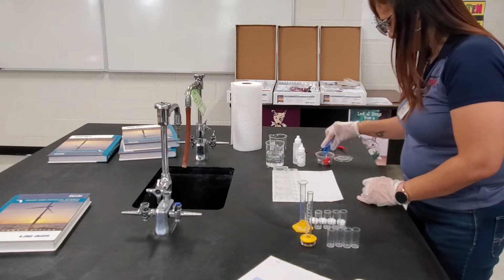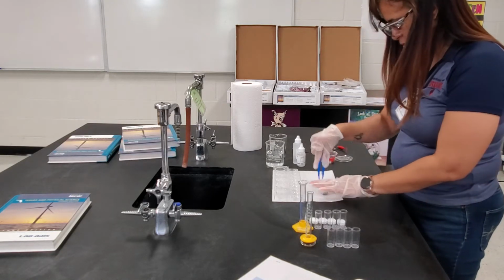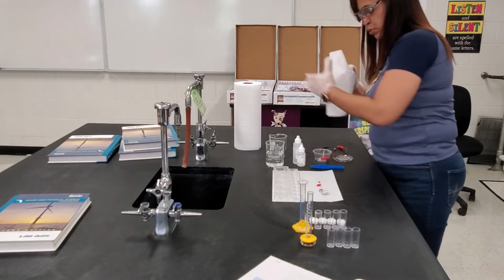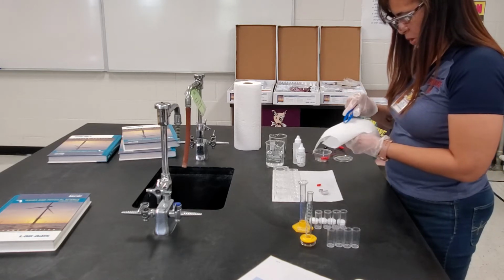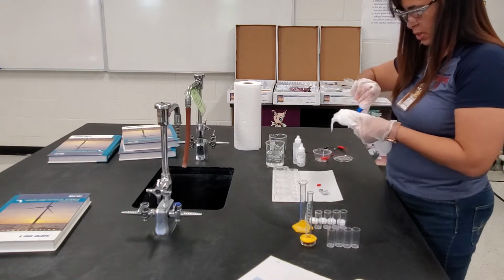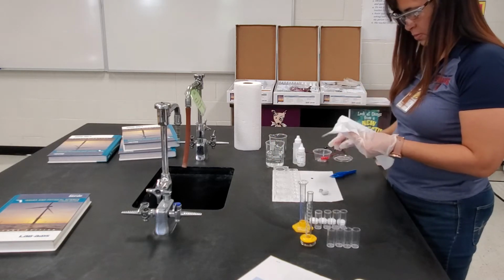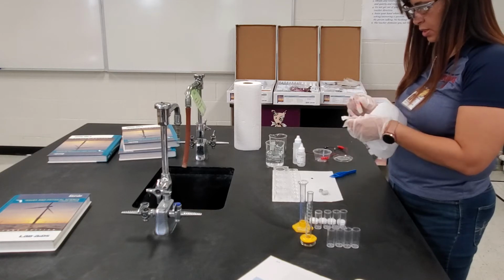So let's go ahead and take out all of our solids. Now the metals are pretty clean. The plastics might require a little bit of cleaning, especially the red one, because it is a tube. So I'm going to wipe off the plastics as well as I could. Well, they appear to be plastic. We haven't identified them for sure yet. Dip it in a little bit of water, clean it off, and take the red one and do the same. In this case, I'm going to try to get the inside clean as well.